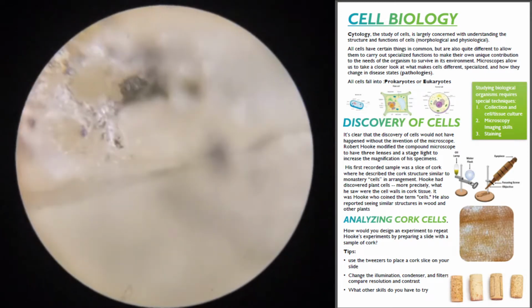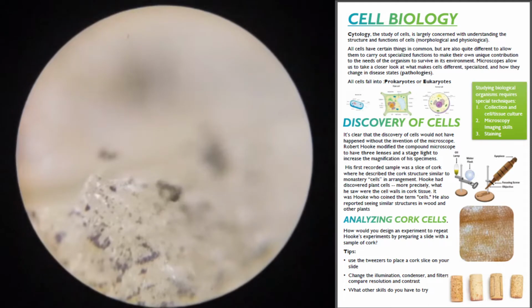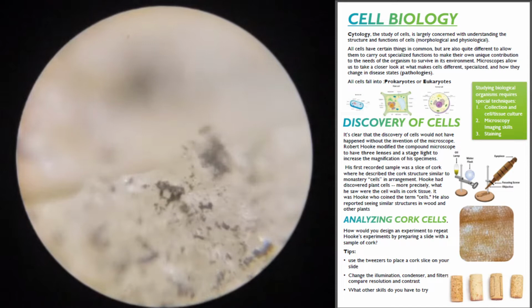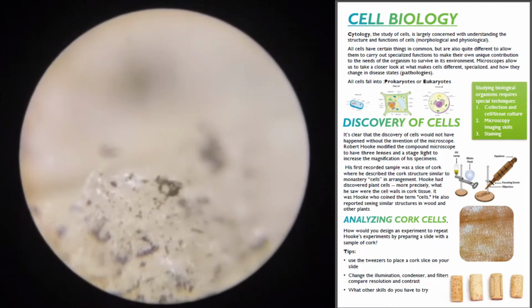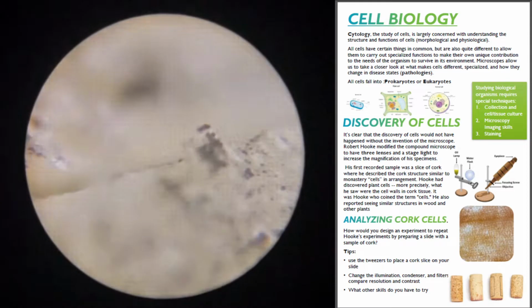Layers, like when we looked at the newspaper. So this all comes down to depth. There you can see the parts that are closest to me are clearest. I'm going to go a little bit deeper. Now the ones that are a little further away. So I'm looking here, peak of the mountain, mid-mountain, heading down towards base camp.